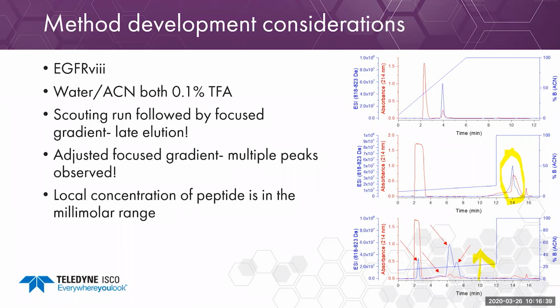However, I see from my mass spectrometer that my compound is eluting at the solvent front in the DMSO. I've got a small peak here, and then a couple of peaks out over here. So I have a little issue: I see my compound, but I'm going to lose some of the compound in some of these other peaks that I might not otherwise collect.